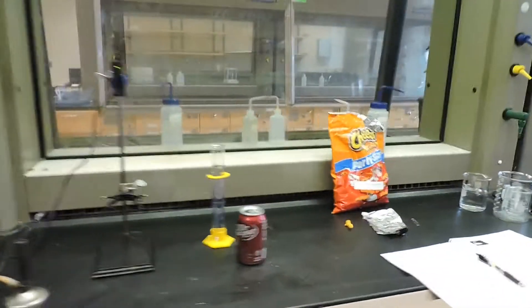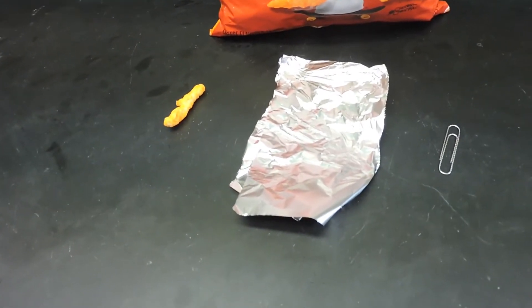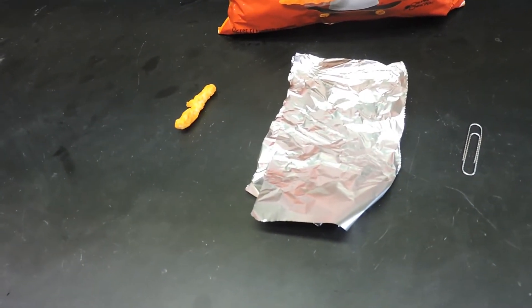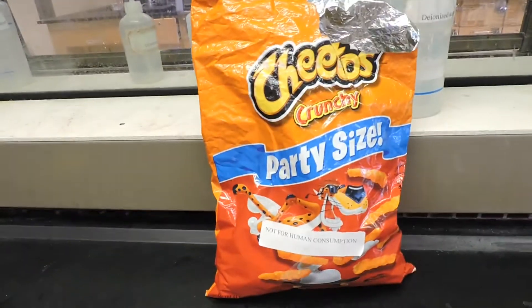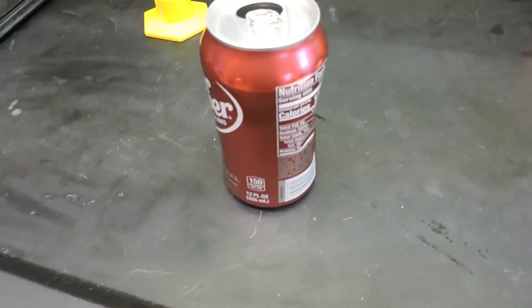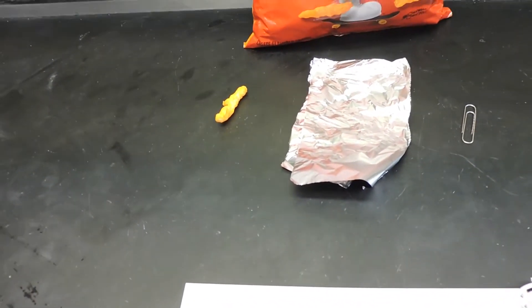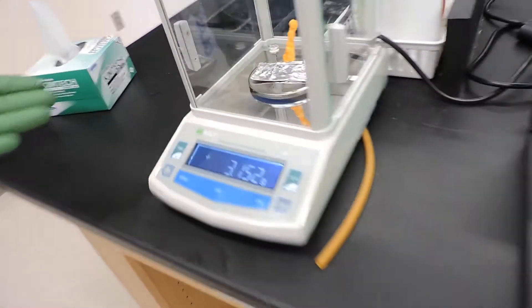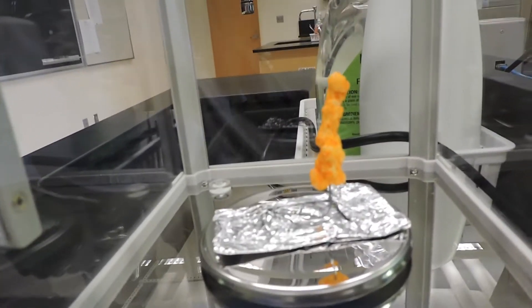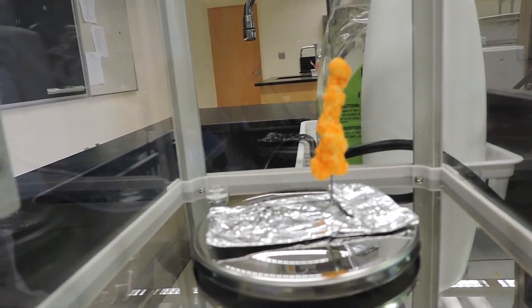Under our hood we have obtained a paper clip, a piece of aluminum foil, and our food sample which is Cheetos. We also have an aluminum pan. We've set up the paper clip, aluminum foil, and Cheetos into a stand. You can see that we've poked the Cheetos onto the paper clip so that it stands upright.